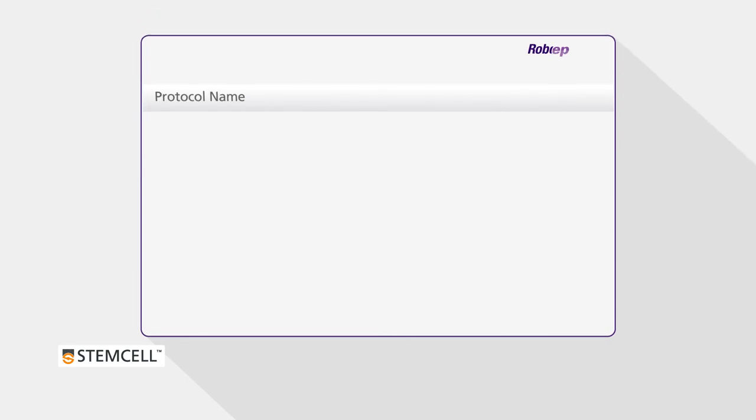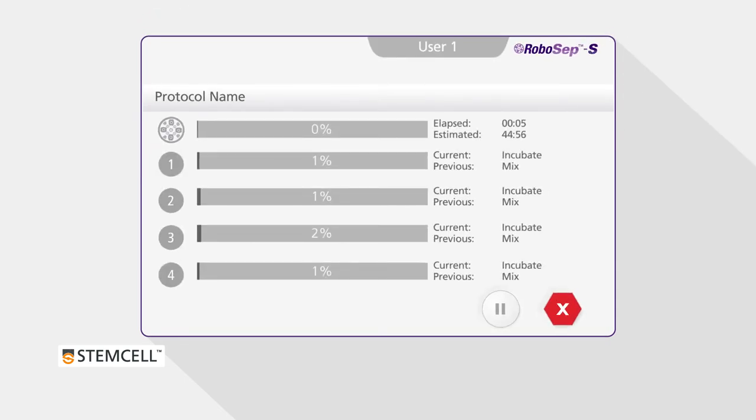A Run Progress screen will appear after approximately one minute. The time remaining until each quadrant completion is displayed on the screen.